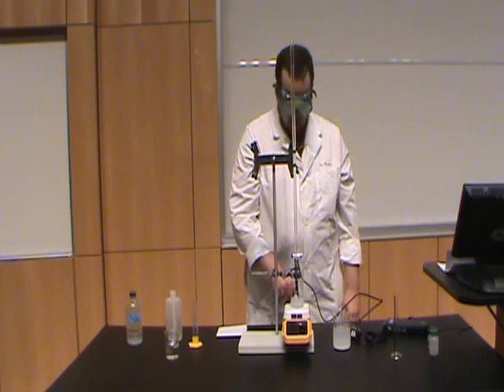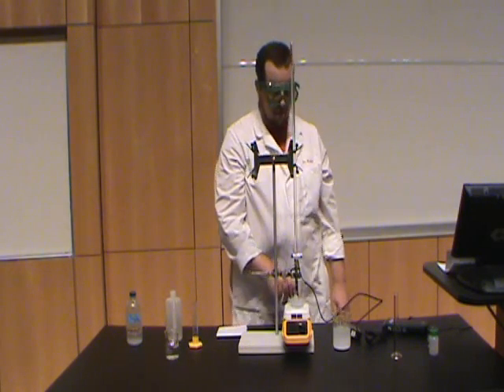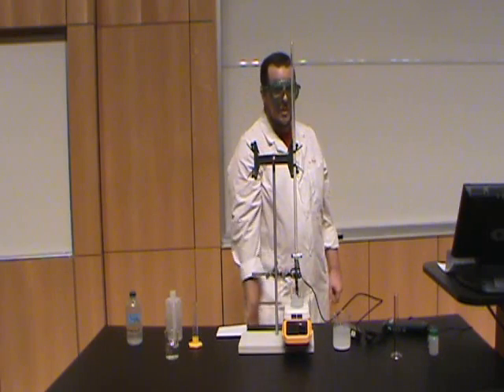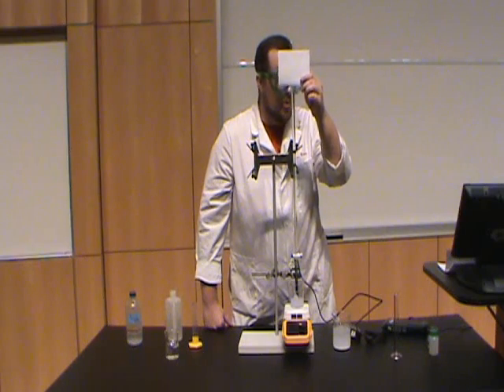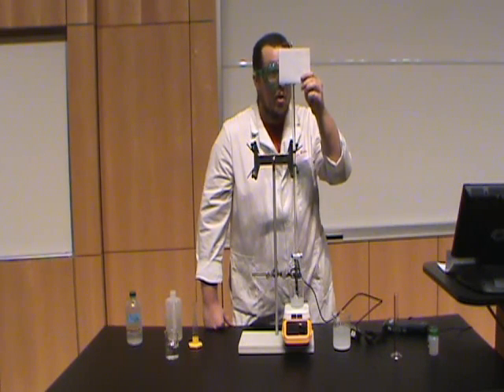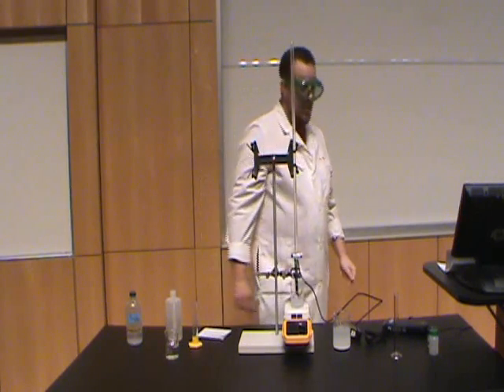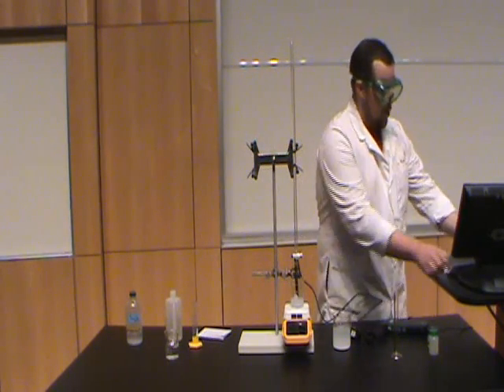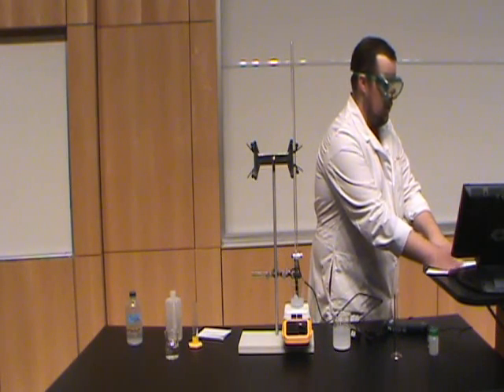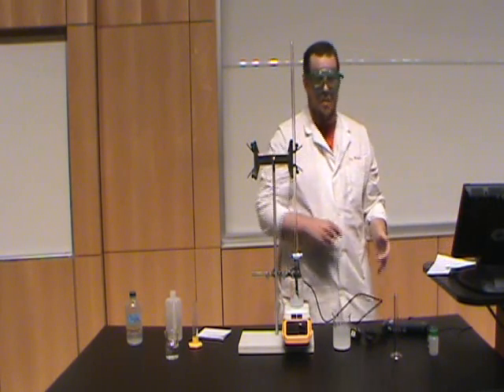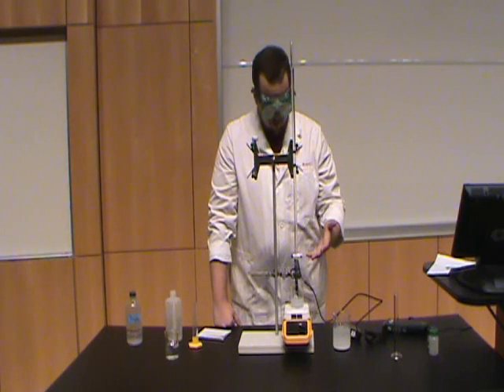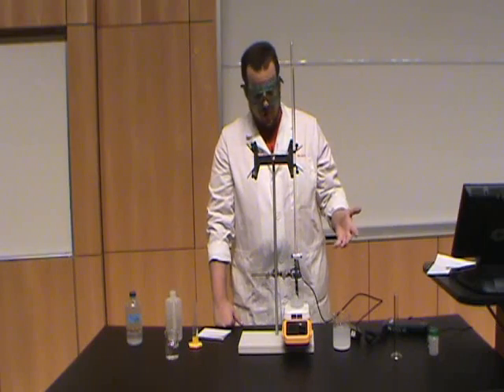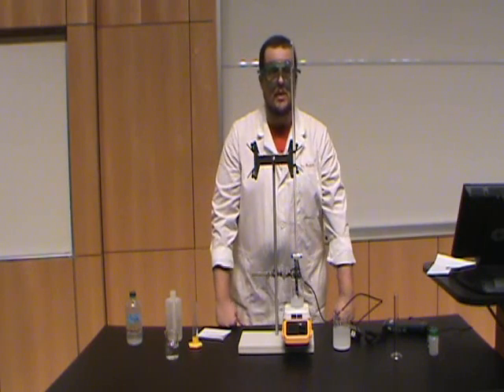You may have noticed that precipitate is already starting to form. Hmm. I wonder what the identity of that precipitate is. Let's take our next burette reading. It looks to me like it is 1.21 milliliters. So 1.21 milliliters. That means that I've added 0.88 milliliters to my sample so far. So it was about 1. That's exactly what we want to do.